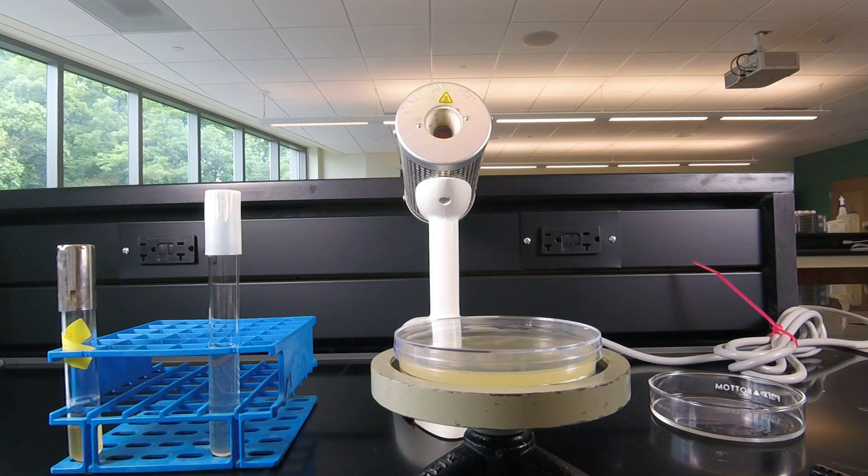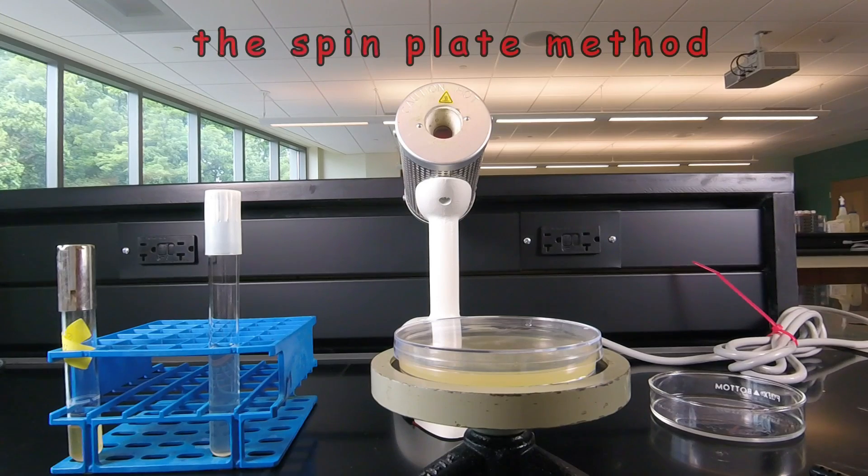In this video lesson we're going to learn how to obtain isolated colonies for cloning using what's called the spin plate method.